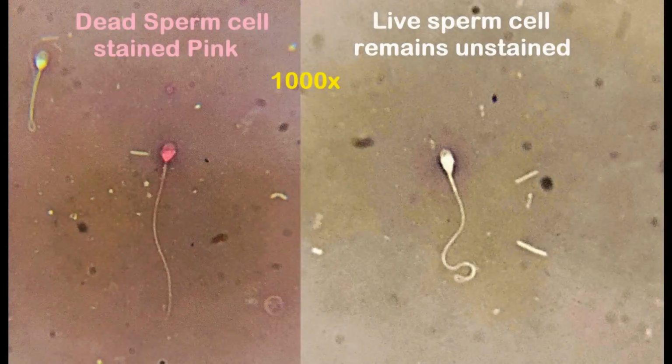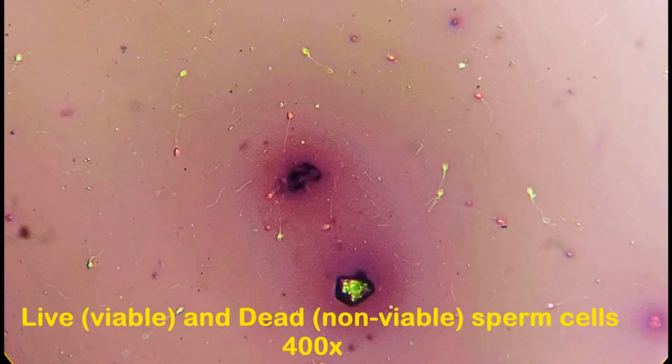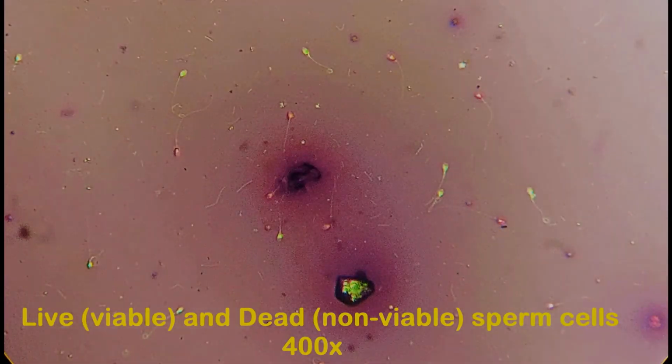Dead sperms, that is, the sperm cells that were already dead in the fresh semen sample, are stained pink in their head region, while live sperms, that is, the sperm cells that were motile or immotile but alive in the fresh semen sample, will remain unstained. Observe 100 or 200 random sperm cells and calculate the fraction of live and dead sperms in percentage.